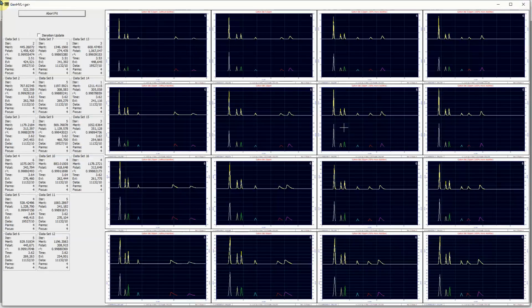These data sets are large, 10,000 to 20,000 points each, and as such the fitting will not be immediate. Also, using this most extensive of the fitting strategies performs a large number of separate fits to ensure the optimal global solution. For complex fits, you will likely want to use this advanced fitting, even if it increases somewhat the overall time for the fitting.